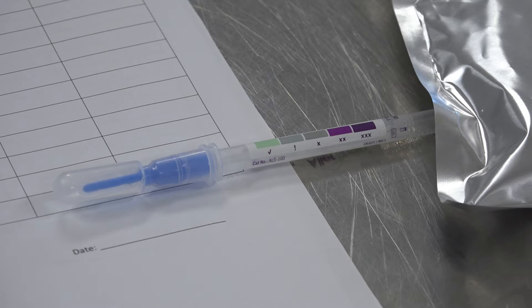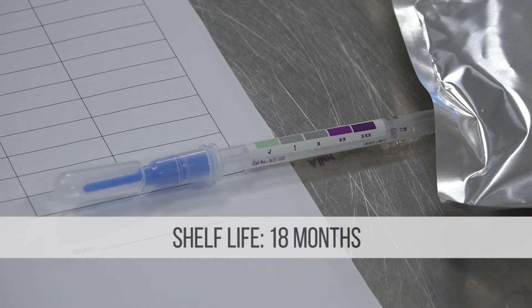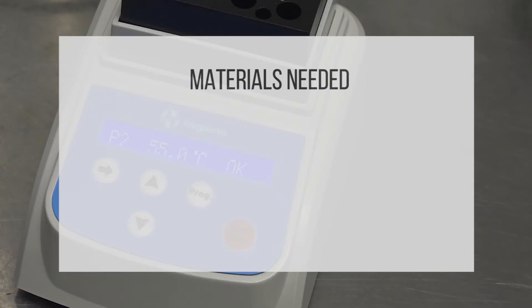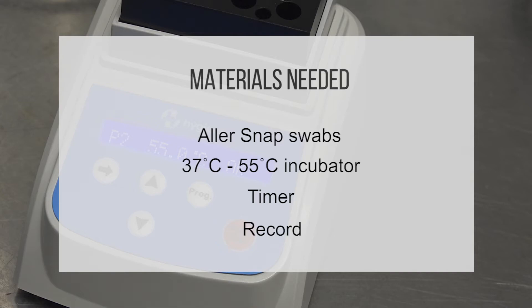Swabs have a shelf life of 18 months when stored at room temperature or refrigerated. The materials you will require are Allersnap swabs, 37 degree to 55 degree Celsius incubator, a timer and your monitoring record.